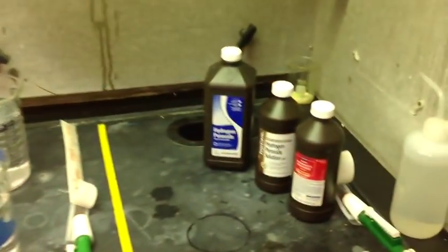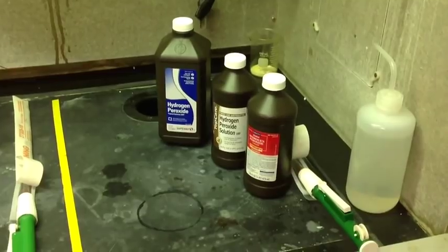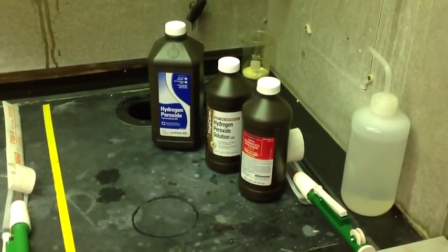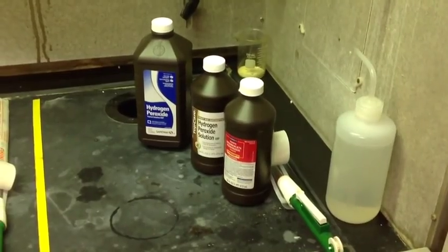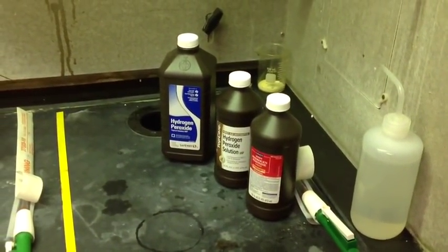In the first section on the right hand side is where you're going to start with your Erlenmeyer flask and you're going to get 5.00 milliliters of the hydrogen peroxide. It goes out to the hundredth place so it's pretty exact. Please get exactly that.